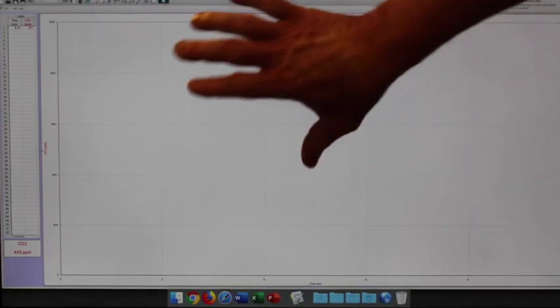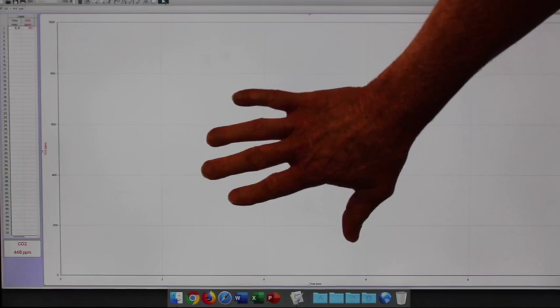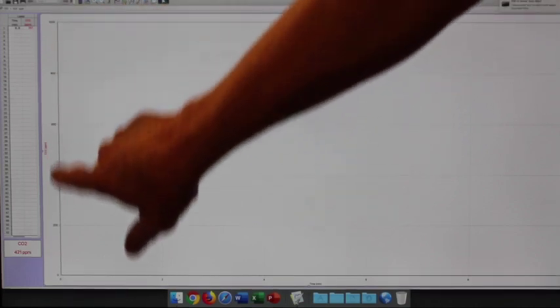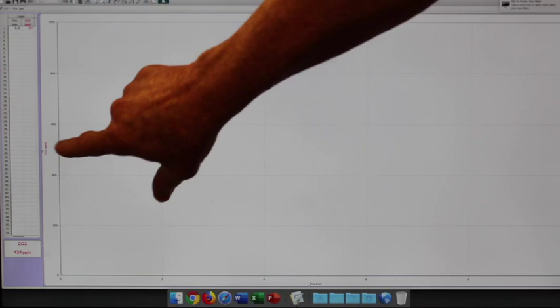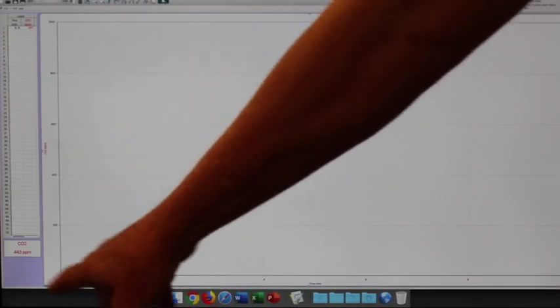And so if you look here, here is a graph. We have our y-axis being CO2 parts per million. So we're going to be looking at CO2. Here's a live reading of CO2. We have about 454 in the chamber right now. Down here, our x-axis is minutes. So I'm going to click play up here, and I'm going to allow that to get started.